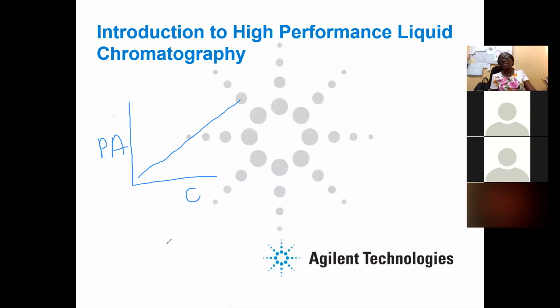Now my sample that I've extracted, I will inject it into the HPLC. I don't know the concentration, but the HPLC is able to give me the peak area. So the peak area that the HPLC gives me, I will note it. Then I'll come back to my calibration. Let's say the peak area is something over here.